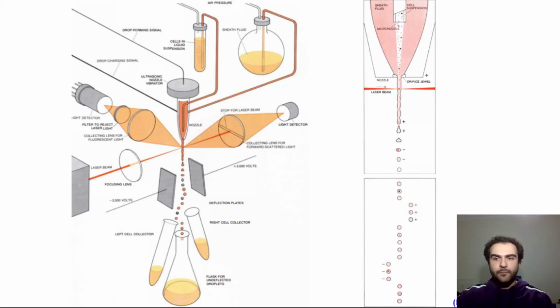The basic principle of flow cytometry is to measure single cells in a flowing stream of fluid. The cells pass sequentially through the beam, and fluorescent light from the cells gives rise to electrical signals. The stream is broken into a series of uniform size drops downstream of the laser, and the cell signals are used to give appropriate electrostatic charges to the drops containing the cells.